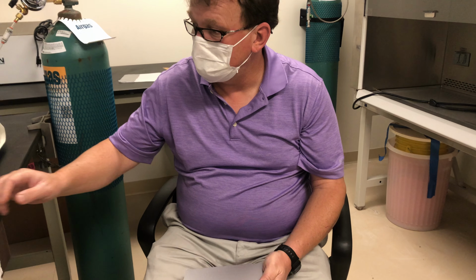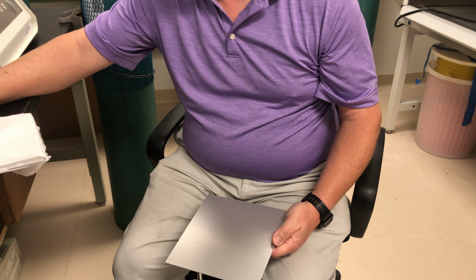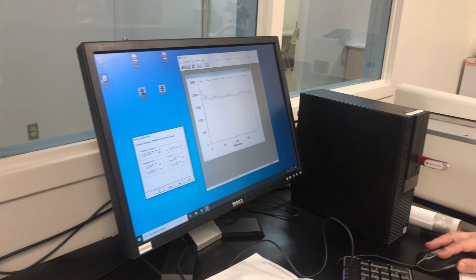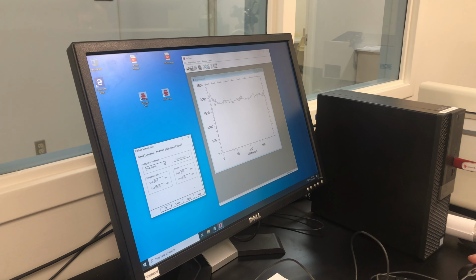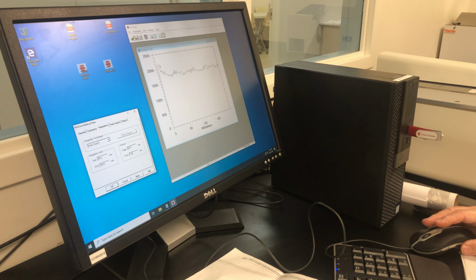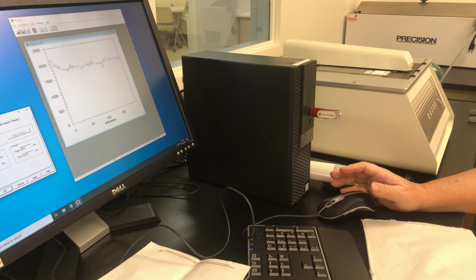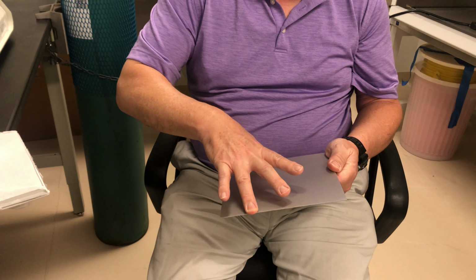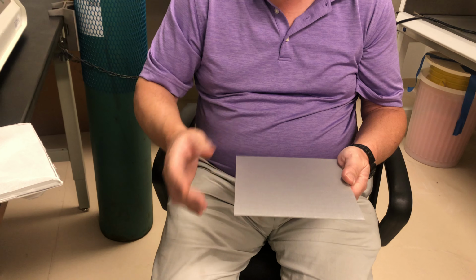The reason is, if you started at 0 and put the plate all the way down here, I know that the response is much higher at this beginning. So if I do actually have some activity here, it's going to be overcompensated because the sensitivity of the detector is higher right here. Typically, in the middle, it's nice and flat. It's just the way they are. Unless you have to, like with 20 centimeter plates, if you can stay away from the very edges of the detector, I would.